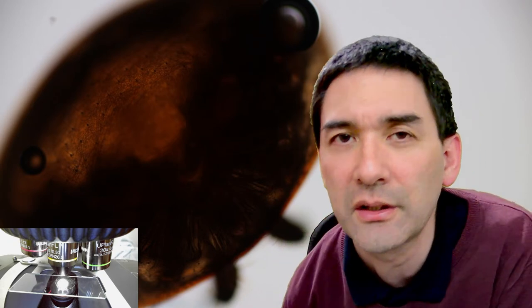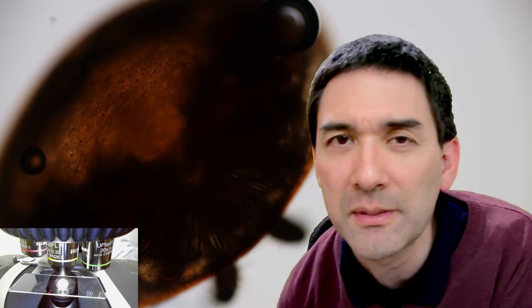I just got a stain kit with brilliant cresyl blue, Janus green, methylene blue, and so on. Yes, that's cool. It's interesting that you're able to get those stains because, as I mentioned already, sometimes chemicals can be a little bit difficult to obtain over mail these days.